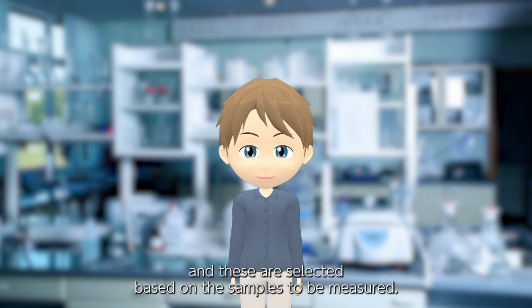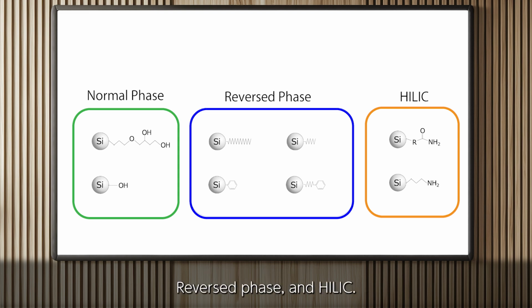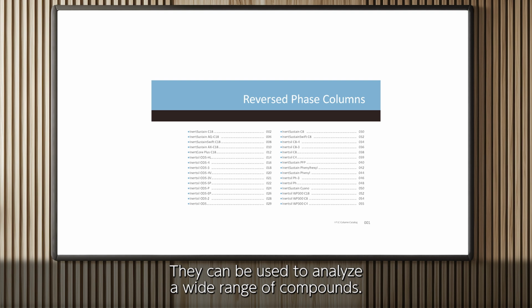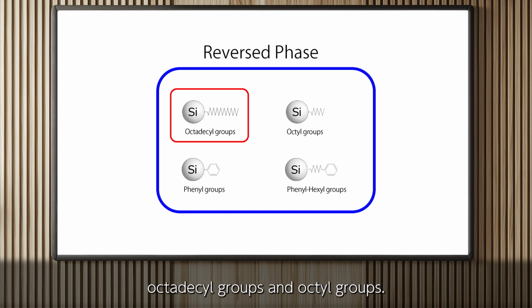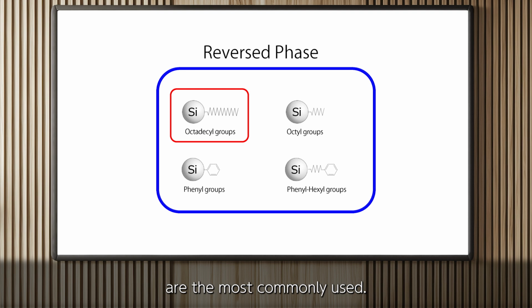measured. I will introduce the functional groups used to modify packing materials, categorized into three groups: normal phase, reversed phase, and HILIC. The first group is reversed phase columns. They can be used to analyze a wide range of compounds. For example, reversed phase columns include octadecyl groups and octyl groups. Among HPLC columns, those bonded with octadecyl group are the most commonly used.